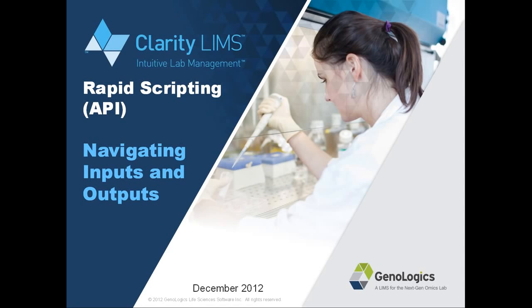Welcome to Module 4 of our API training series. So in this topic we'll deal with the relatively complicated scenario of navigating the inputs and outputs to processes.